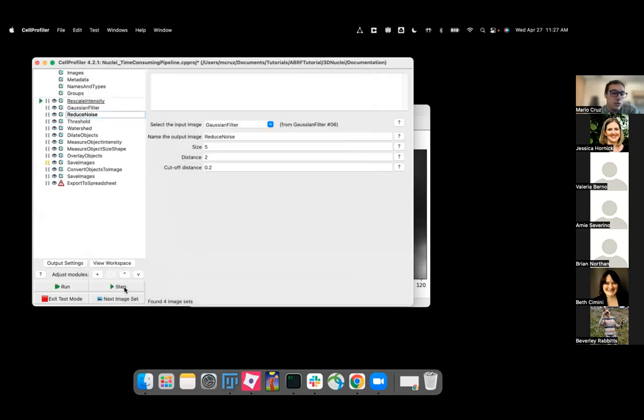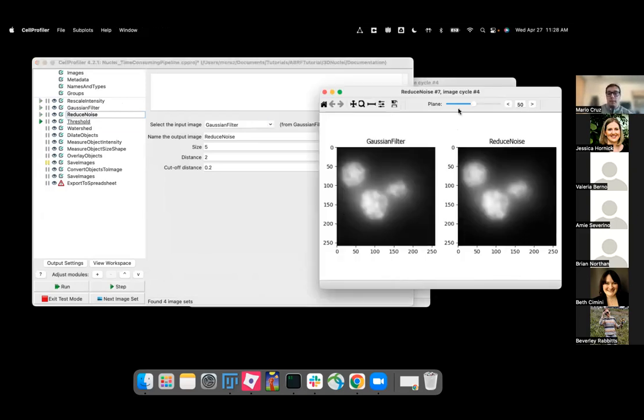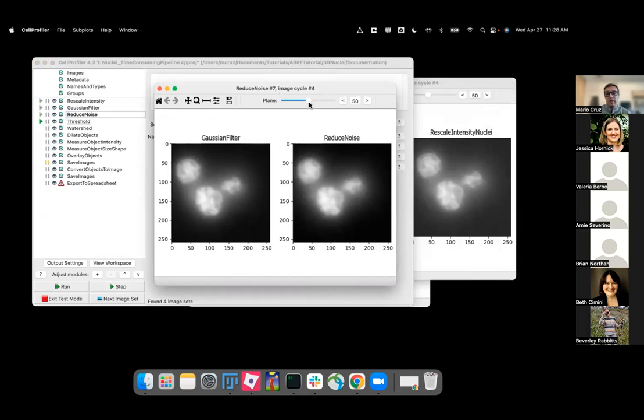Once you have all images denoised, we can see, for example, that even the most noisy image looks like the previous one. So they have a similar distribution pattern, or spreading pattern, of light.